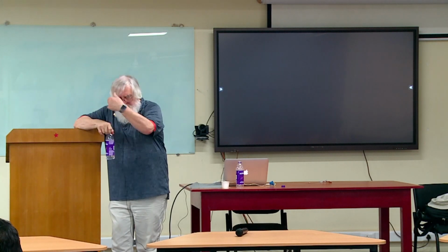Question? Yeah, ask a question. Camera's still running. Ask it. So you're preparing a sample for these flexible polymers or biological tissues. Can you suggest different ways of embedding it in epoxy and trying to cut it?